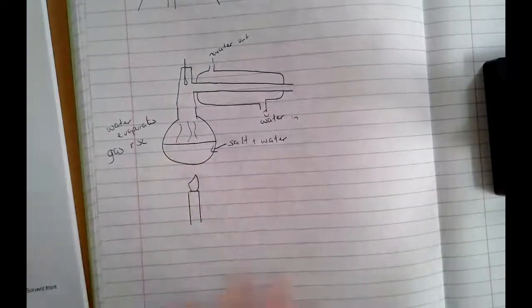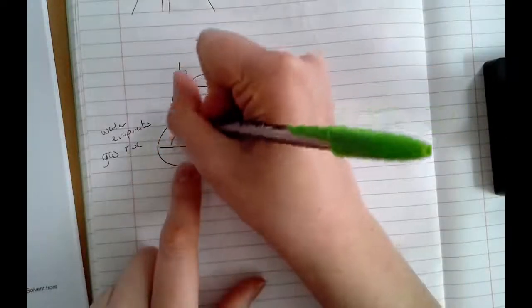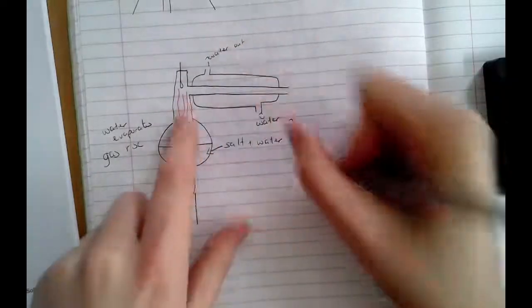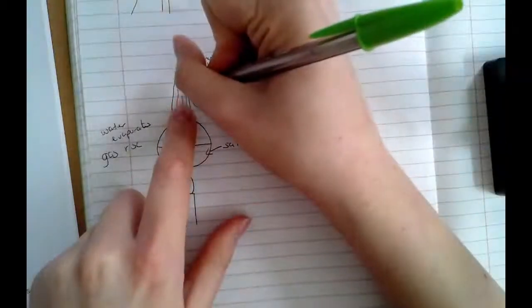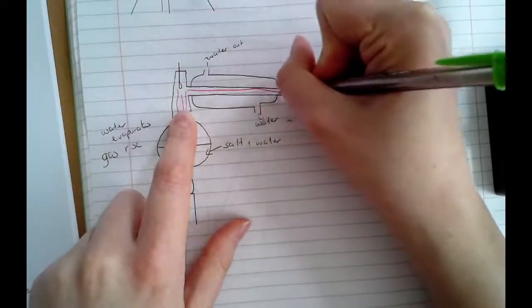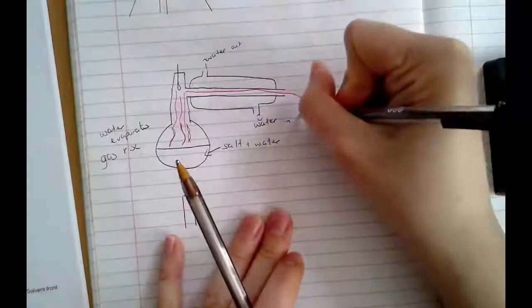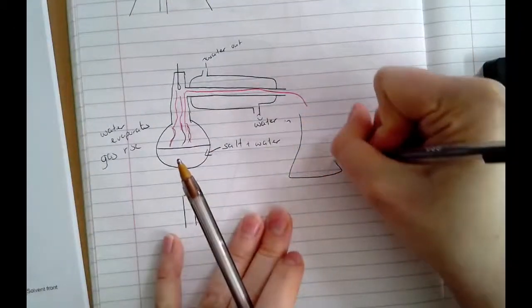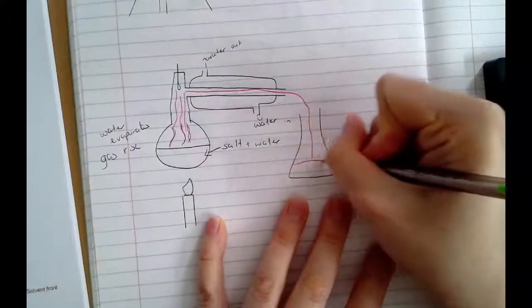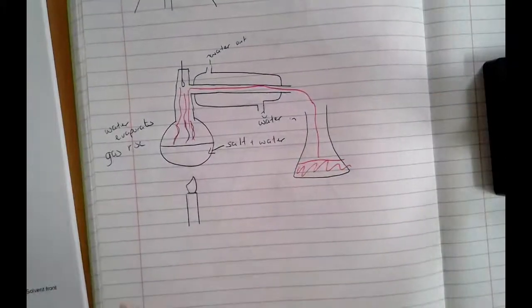So if I track what's happening with the water here, I'm going to use pink. These are the water vapor. It's rising up, rising, rising, rising. It hits the condenser and it cools down, and then that water is going to move along the condenser and it's going to be collected in a conical flask. It's going to be collected here in the conical flask.